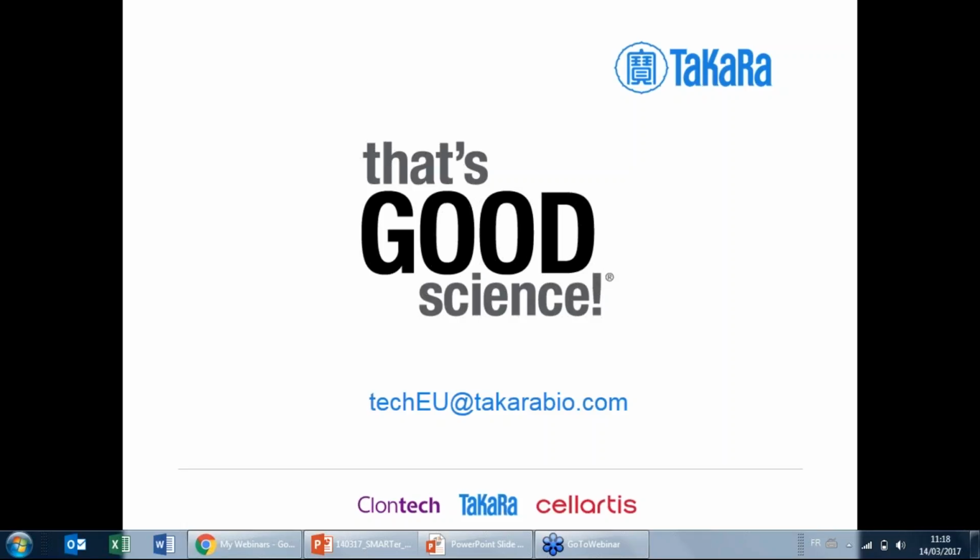We have used it on bacteria samples, and it's been used a lot in metatranscriptomic studies, either from human gut samples or from samples from ocean bottoms, things like that, in which you will have a mixed population. So you can use SMARTer Stranded for that.